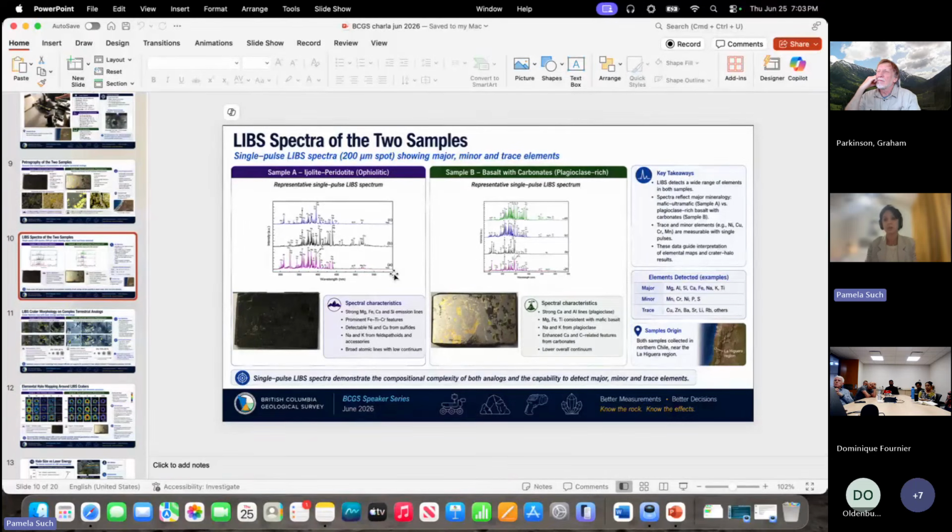So you can change the composition in a very small hole that you produce, like in our case we did for our experiment, because it didn't have sense to do it in a full core. But if you use LIBS and you produce 1,000, 10,000, 100,000 holes, when you're mapping the core, you will create the same. You will be changing the mineralogy because you're blasting the sample.